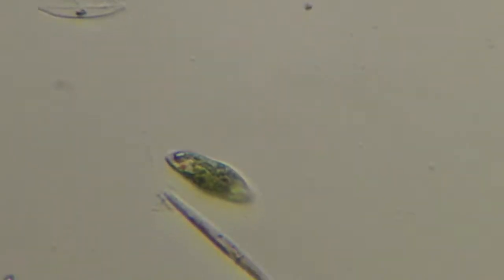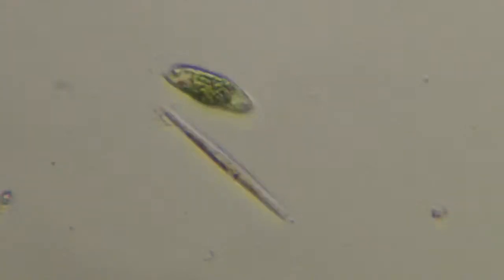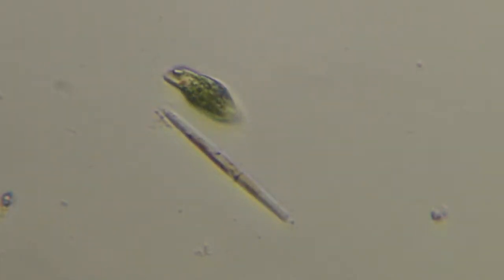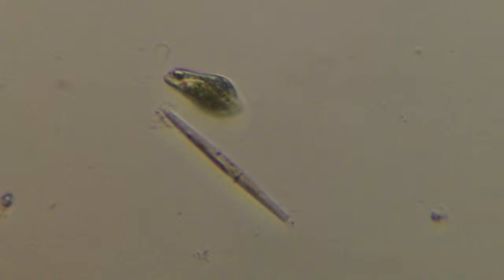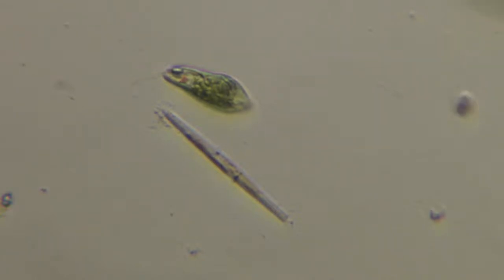Here's a nice close-up of one. You can see the red eye spot there, kind of orangey red. See the flagellum whipping around to the left there, making little swirly patterns. Let's fix the contrast here a little bit. Very nice. This one tends to whip. It's a long flagellum. It whips around in all directions, but sometimes you have to defocus to see the flagellum.